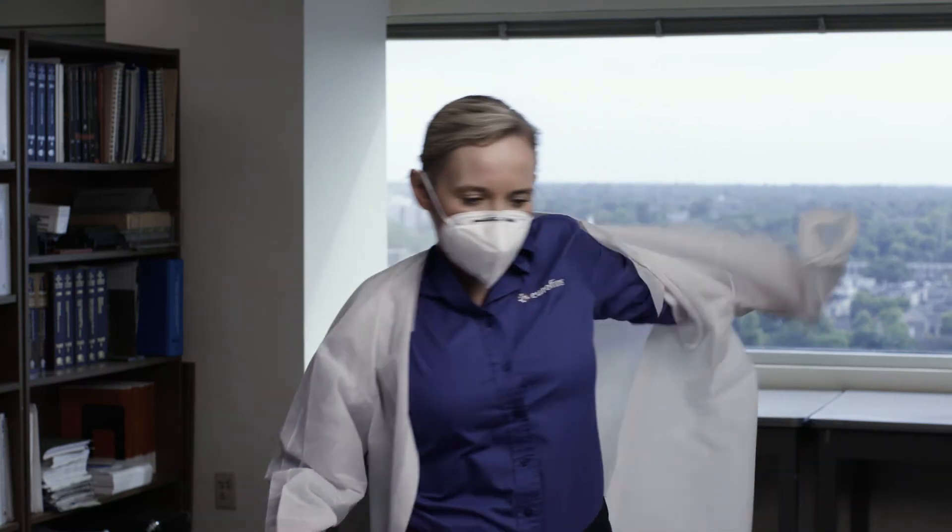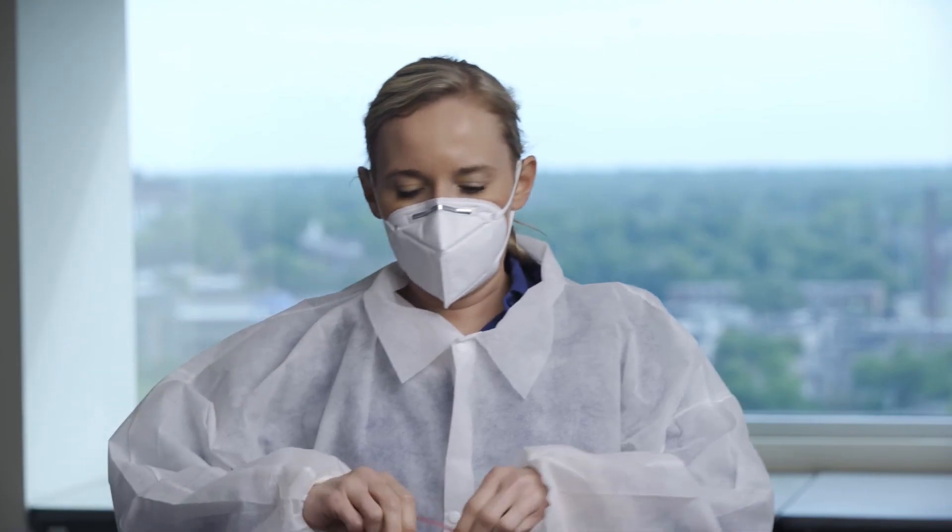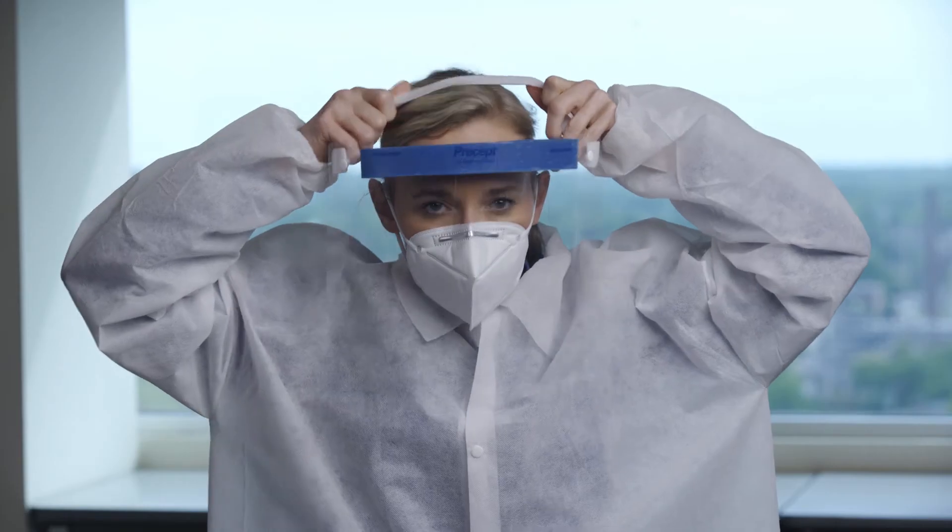Next, put on your lab coat or gown and ensure that it is fully buttoned or tied up. Put on your face shield or goggles and adjust to your comfort level.